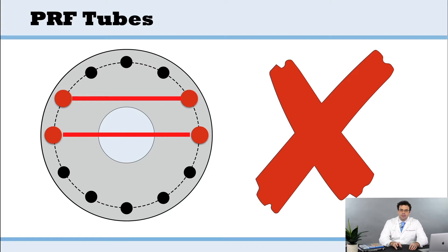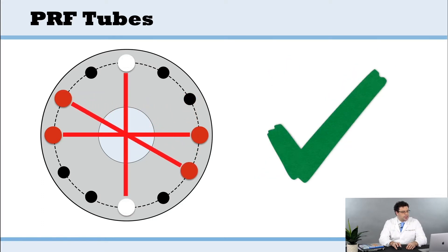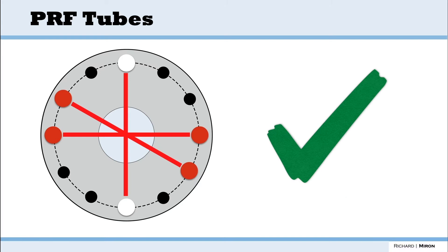This mistake here we see sometimes made — make sure it's one you don't make. It's obviously not balanced; it has to be in the crisscross pattern as explained. And whenever we incorporate white tubes and red tubes at the same time, always remember that white tubes have to be balanced against each other.